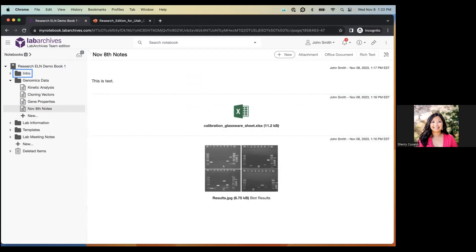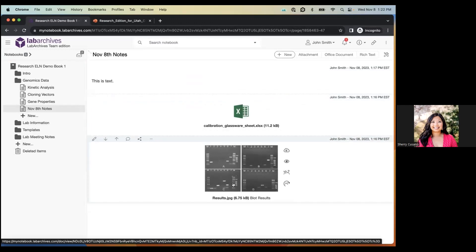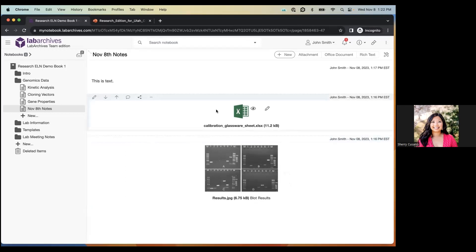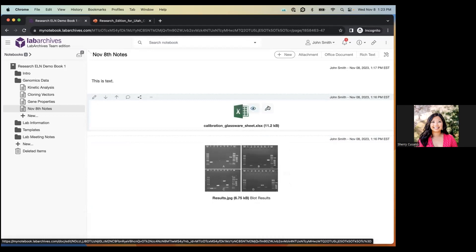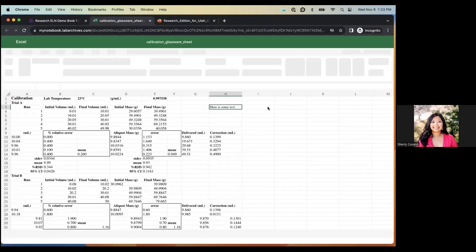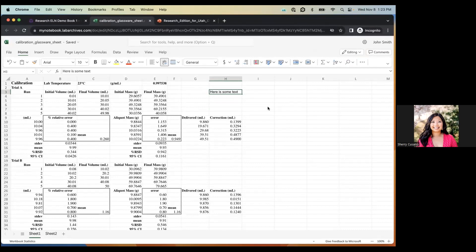Let's go back to the November notes page we created. On this page I added a rich text entry, an Excel document, and a JPEG image. With some files you can view or edit them directly within Lab Archives depending on our integrations. Even without downloading the Office plugin, we have an Office Online integration — so if you hover over any Office document, you'll see options to download, view, or edit. Clicking 'Edit' opens the document in a new tab where multiple individuals can work on it simultaneously, with all edits auto-saved with a timestamp.